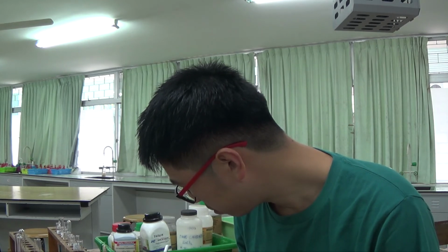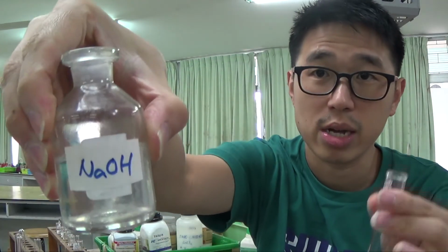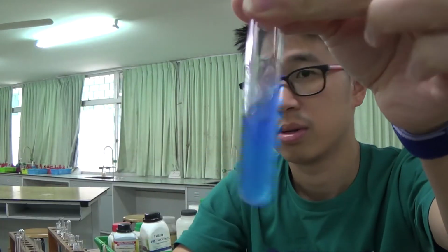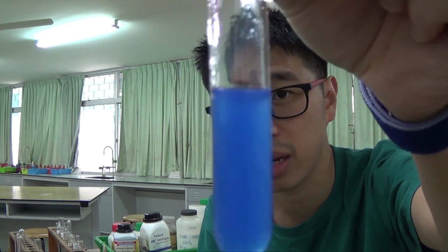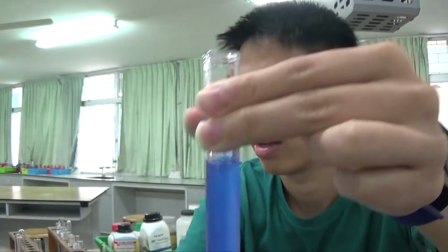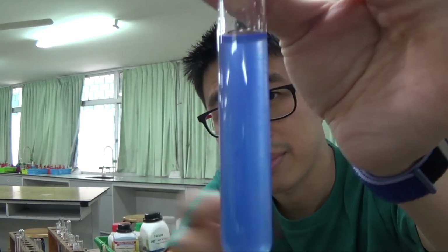As usual, we need to add excess sodium hydroxide. So this is sodium hydroxide. I have this much, so I'm going to add excess by pouring the sodium hydroxide in. Yes, the color has gone deeper, but it is not a solution. Okay, I can add more sodium hydroxide. So the color has deepened again, but let it settle.